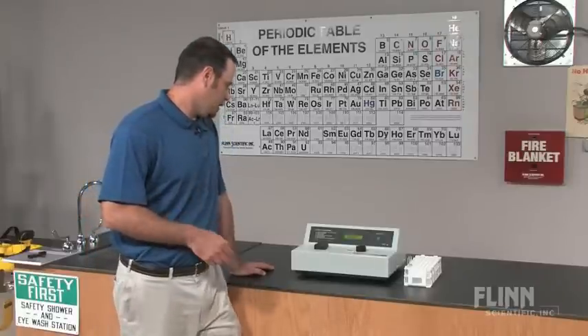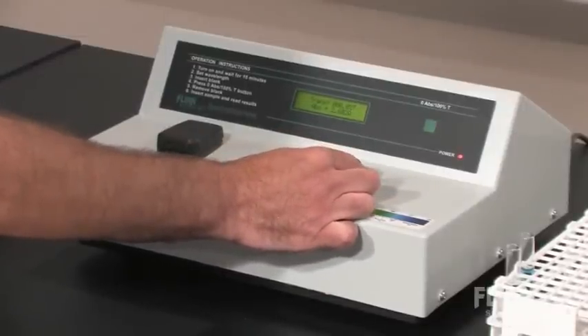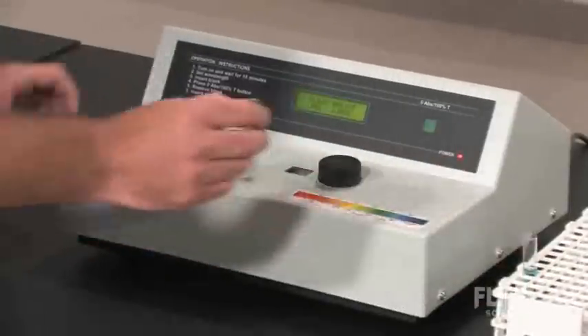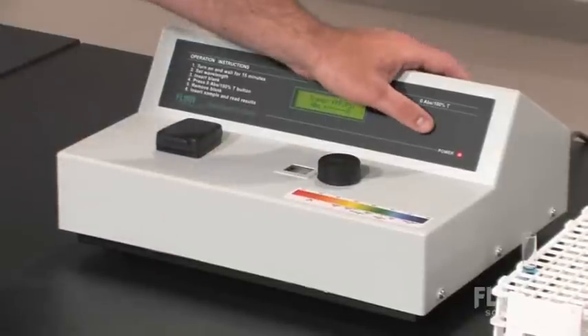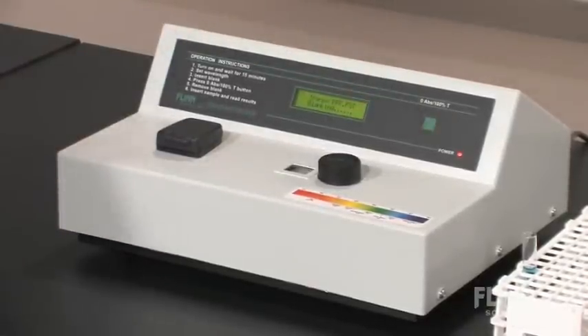After you've done that, you want to set your wavelength with this knob right here. Then you want to insert a water blank, close that, and then hit the zero absorbance, 100% transmittance button, and it will automatically blank the unit for you.